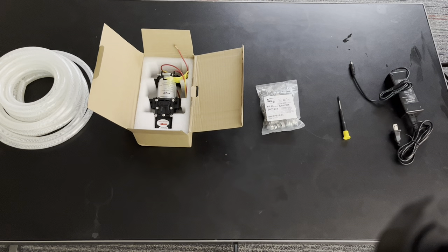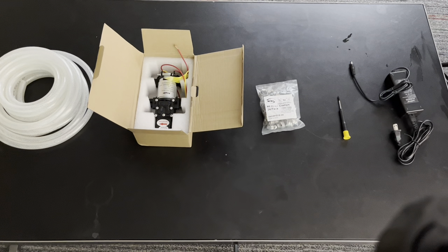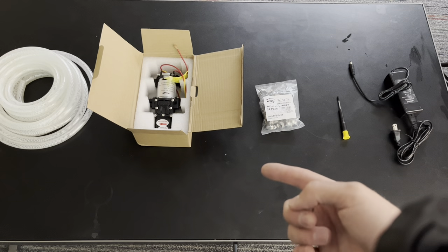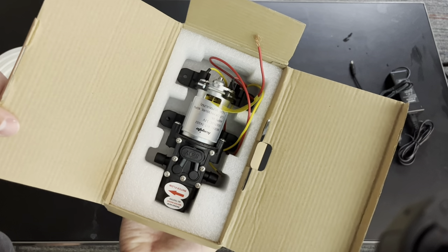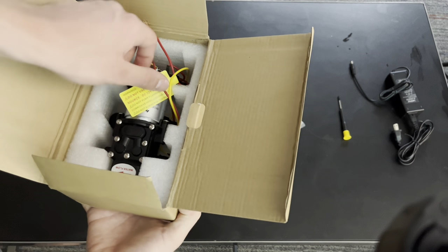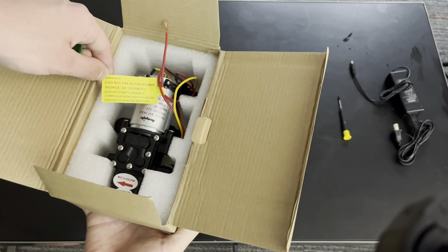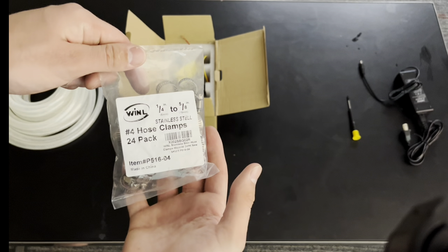In front of me I have everything I'm going to be using in this build. On the left hand side you'll see some PVC tubing. It's really important that the tubing is 3/8 of an inch inner diameter, because that will fit all of your glass joints if you're planning on doing a vacuum distillation, and it will also fit with your water pump. I'm using a diaphragm pump. It's very important that your water pump has similar ratings to your faucets, since that's what aspirator pumps are typically meant to be used with. Make sure that it is rated for between 1 and 2.2 GPM, or something like 60 PSI at a minimum. You're also going to want some hose clamps that will fit the diameter of your tubing, so water doesn't come flying out of those gaps between your tubing and your joints.